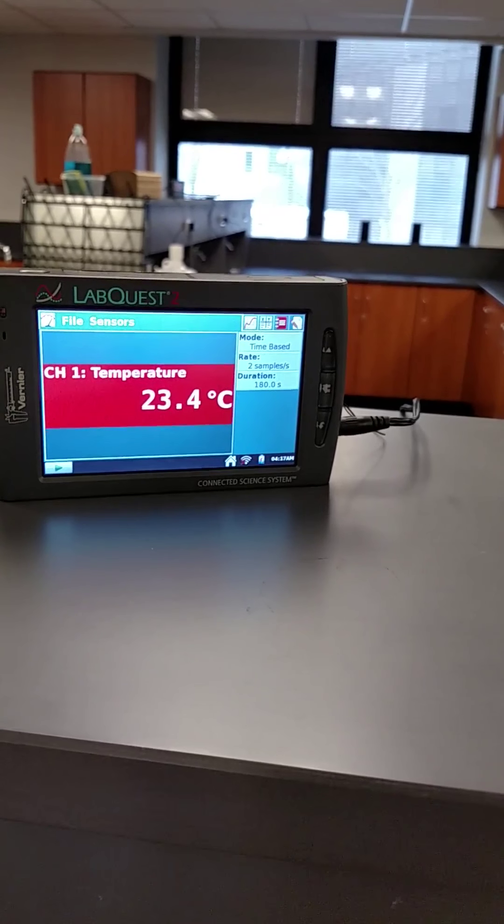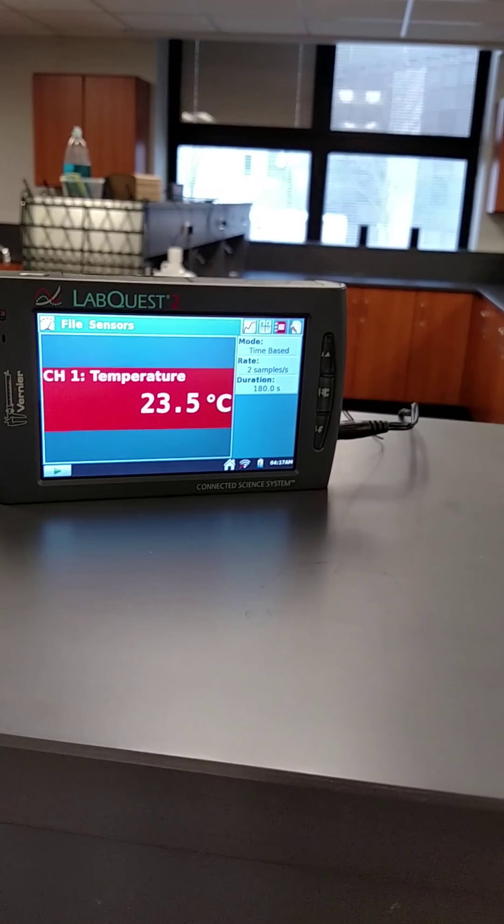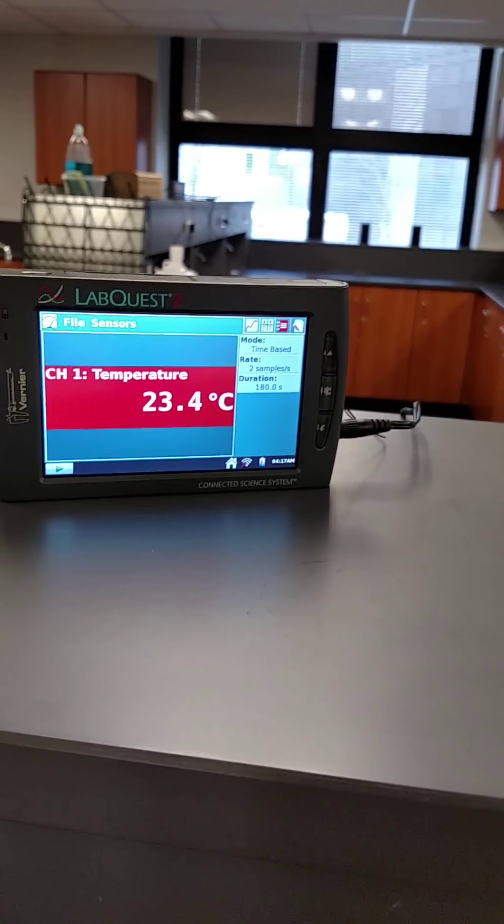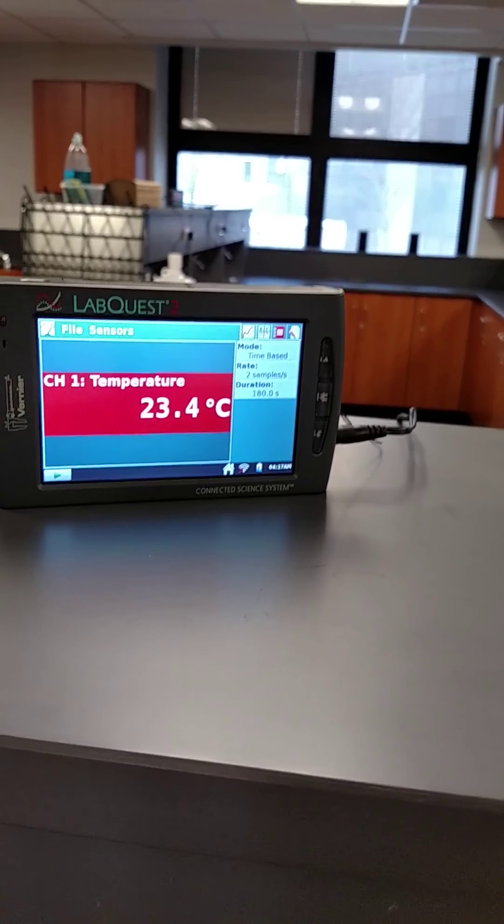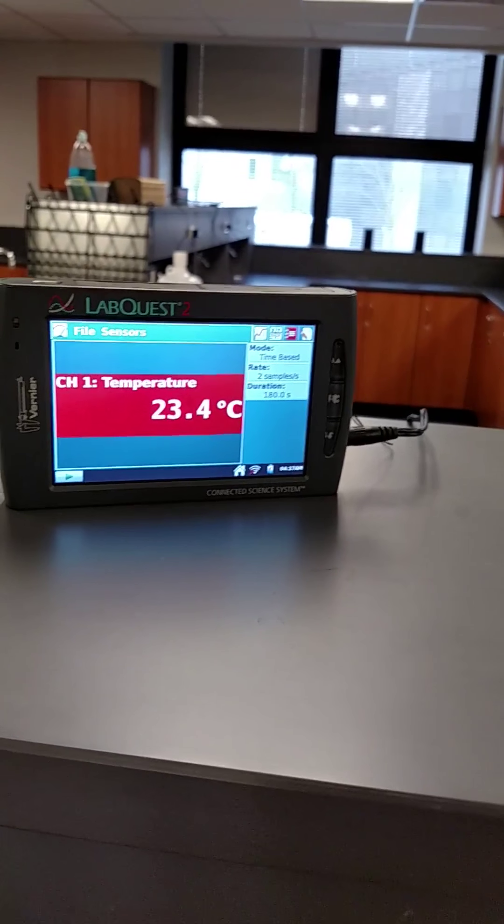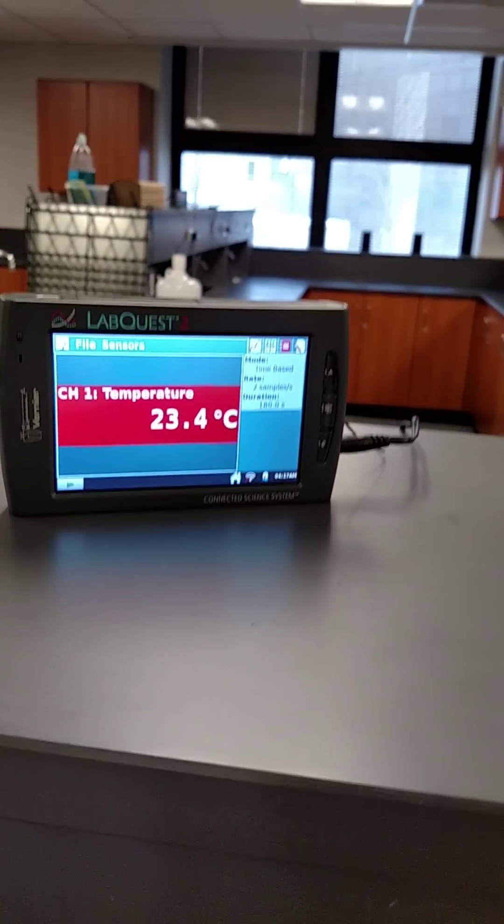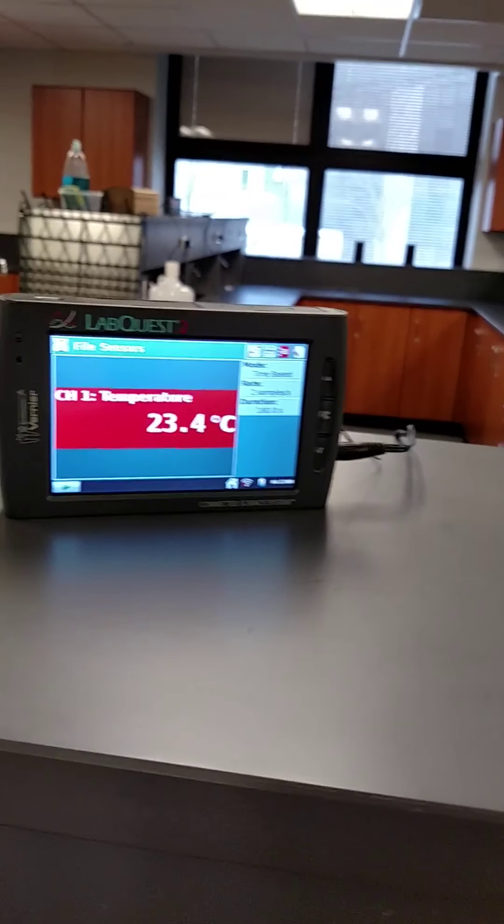The highest I saw was 23.6, so it looks like it's slightly starting to go down now. So 23.6 will be its highest temperature. We're going to do one more, and then I have to clean the probes off.